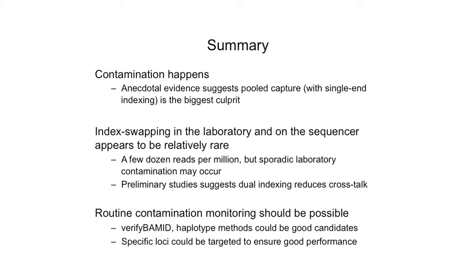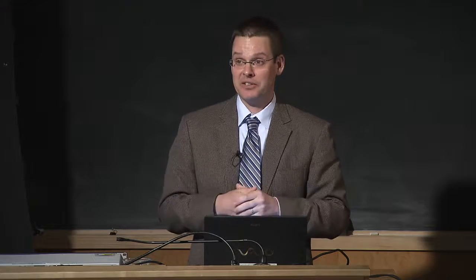Okay, so just to summarize this. Contamination does happen, although I showed you some scary data from the research side that used pooled capture approaches, and I think that's really the biggest culprit. If you do single-end indexing and you pool capture, that's bad. You can have a high level of contamination there in the right scenarios.